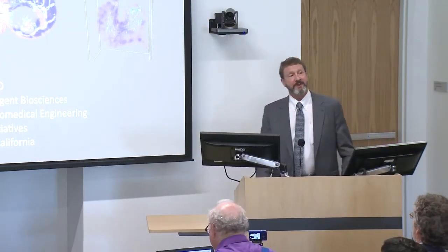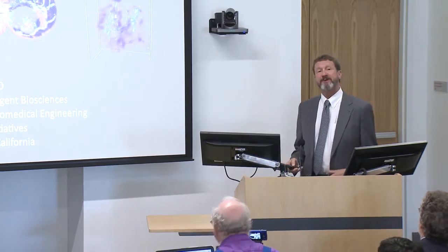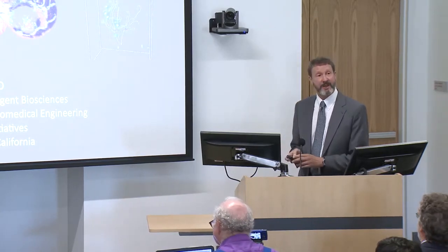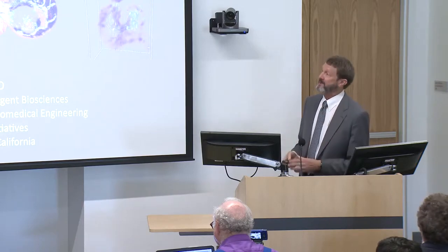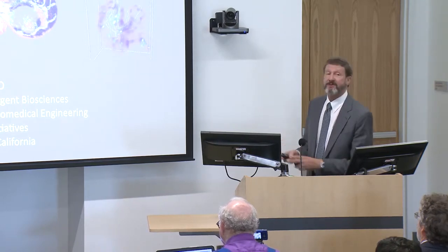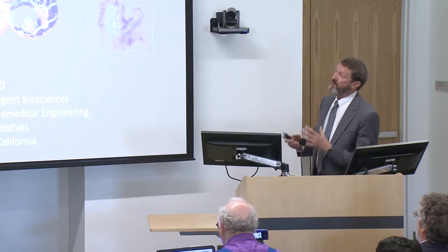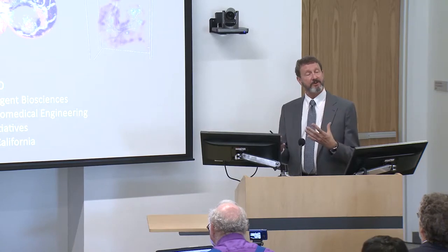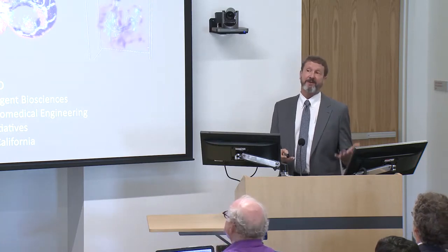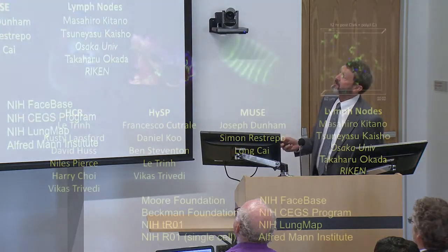And what I want to try to share with you is some of the multiplex and multimodal imaging techniques that we've been deploying for my sort of day job. My day job is to look at things like how forming organs take shape and the multiple influences into them. And my sort of weekend job, together with some of the people in the lab, is to apply some of these tools over into things like draining lymph nodes, and also to try to see if there's a way to take these imaging tools that we've optimized for experimental animals with encoded genetic markers and carry them into humans, which obviously wouldn't have those markers in place. And so if we're lucky, we'll make it through all of it.